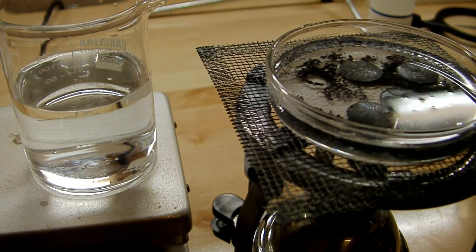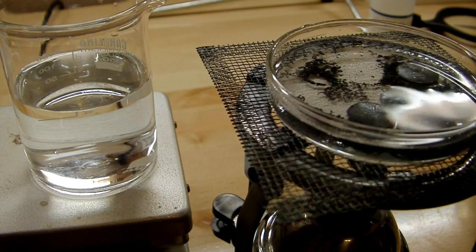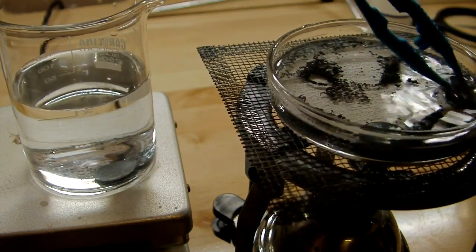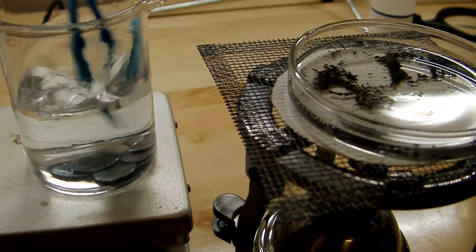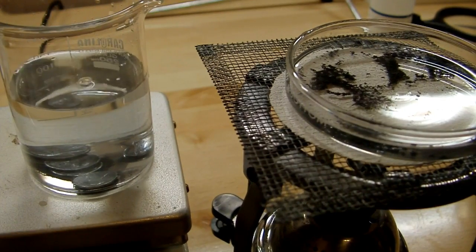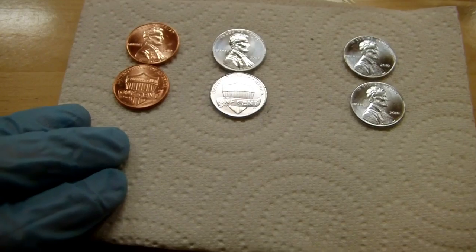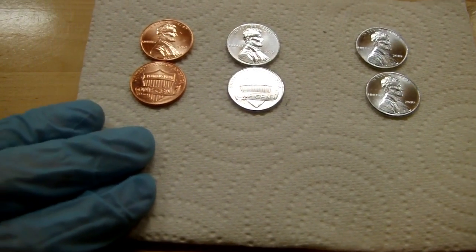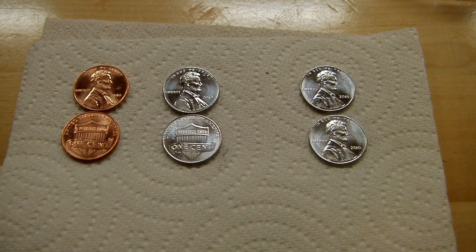I've had this heating for a couple of minutes and the pennies now look fairly silver, so we're going to take them out and just dunk them in some water to rinse them off. Here's what they look like after they've been washed and cleaned of all the excess zinc dust — a really beautiful silver looking color. Now, this is actually just a zinc plating on top. Because pennies are actually a zinc slug coated in copper, what we have is essentially a piece of zinc plated in copper, now plated in zinc again.